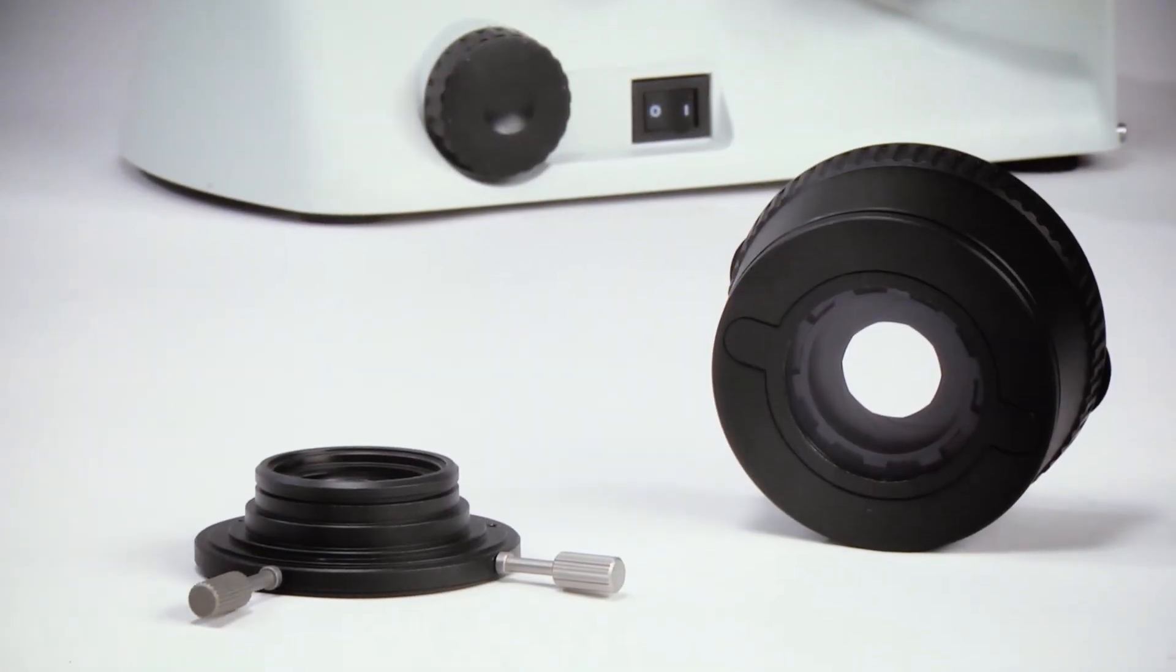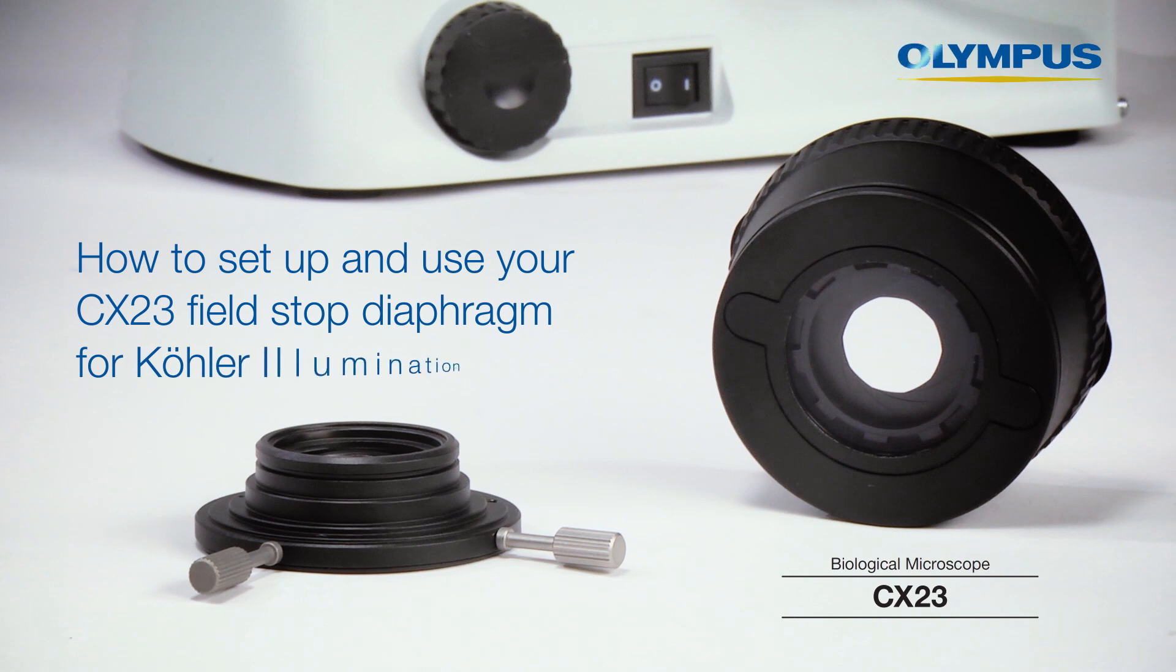This video will show you how to set up and use your field diaphragm and auxiliary lens for Kohler illumination on your CX-23 microscope.